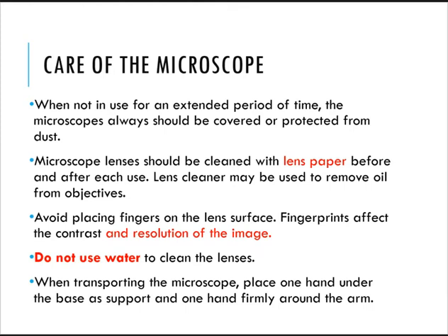When transporting the microscope, I already told you this: place one hand under the base and one hand firmly at the arm or the neck. So, guys, take note, tissue should not be used because it can scratch the lenses of the microscope.